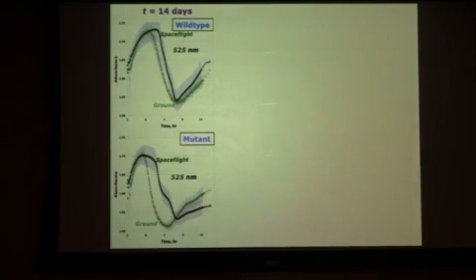And so I'll show you some data curves again from space compared to the ground. Space flight are the darker curves, ground are the lighter curves. This is the 525 nanometers, so the green wavelength, hence the green curves. And what you're seeing here is the interesting shape of this over time, and this is about 12 hours, is the blue turning to pink.